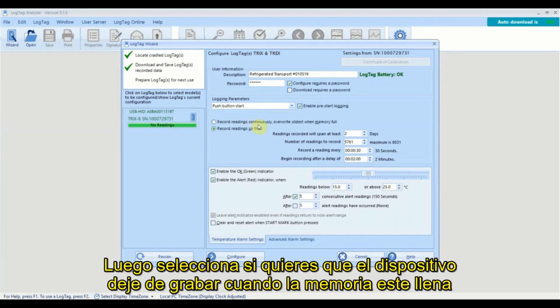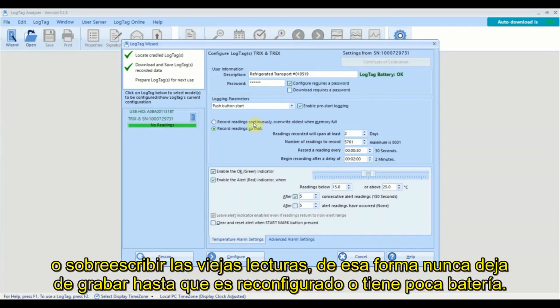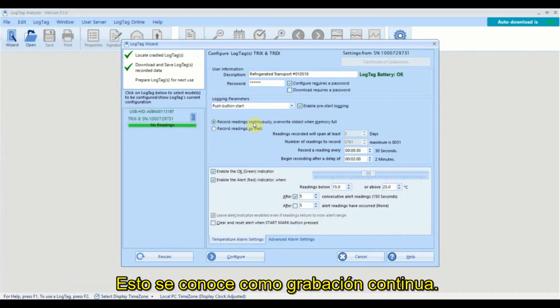Next, select whether you want the log to stop recording once the memory is full or to overwrite the oldest readings so logging never stops until it's reconfigured or the battery runs low. This is called continuous recording.